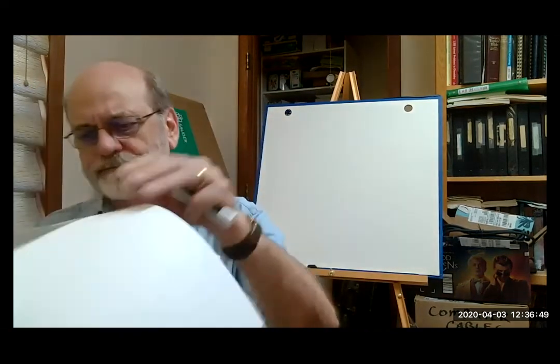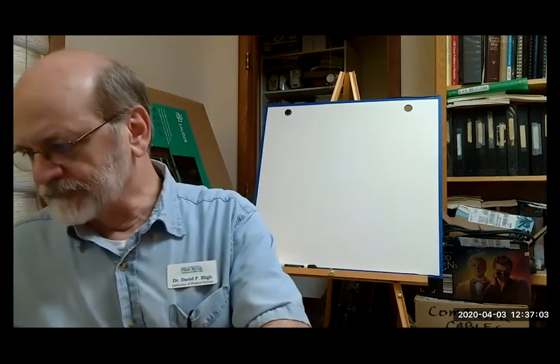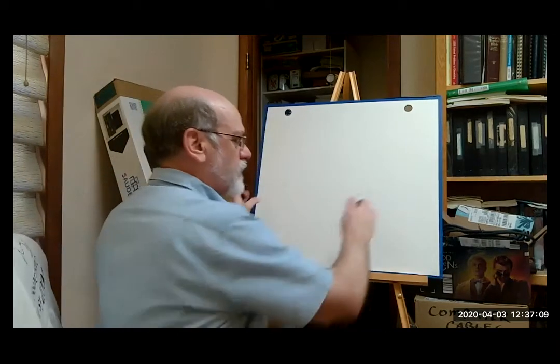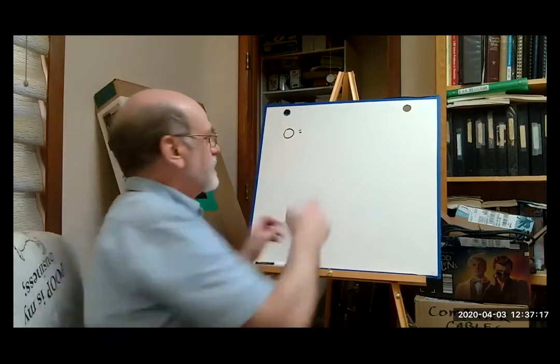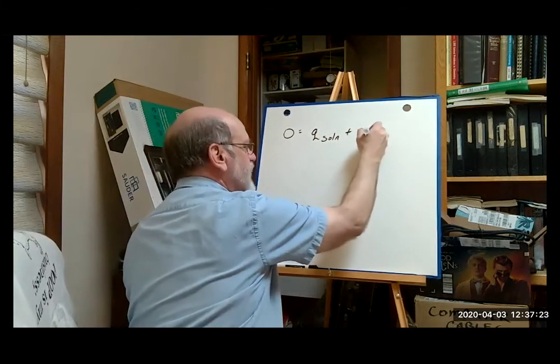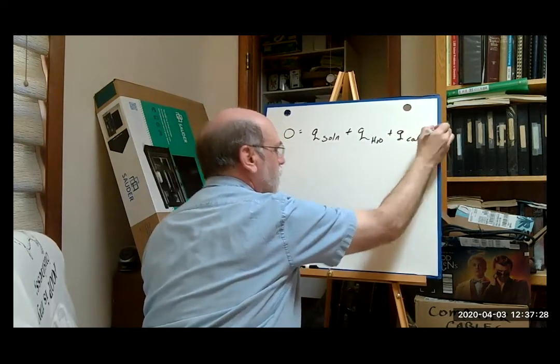So in part 2, we have sodium carbonate being dissolved in water. So what mathematical expression covers what's happening in our isolated system here? Right? Still equal to 0. Then we're going to have the heat of solution plus the heat change of the water plus the heat change of the calorimeter. Okay?